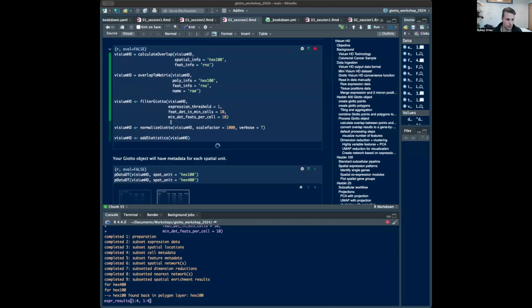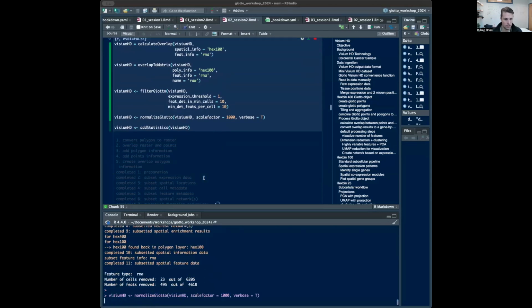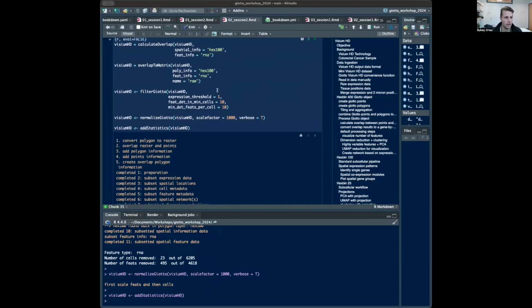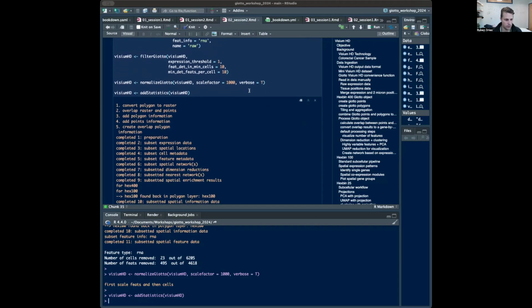So this is quite fast right now, simply because we are using a smaller data set. This might give you some issues when you try to do this with the whole data set. And I think this is a little bit what Eddie will also talk about, that we have thought about some ways to alleviate some of these problems in the very near future.